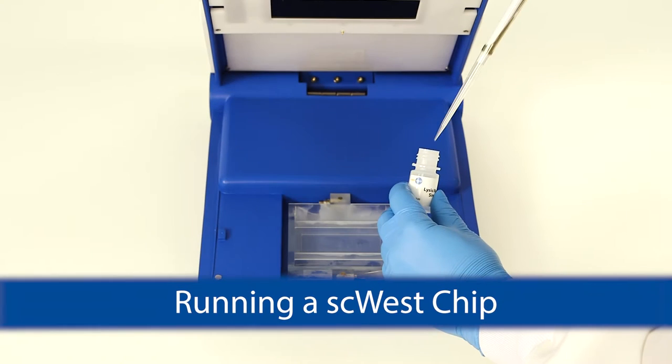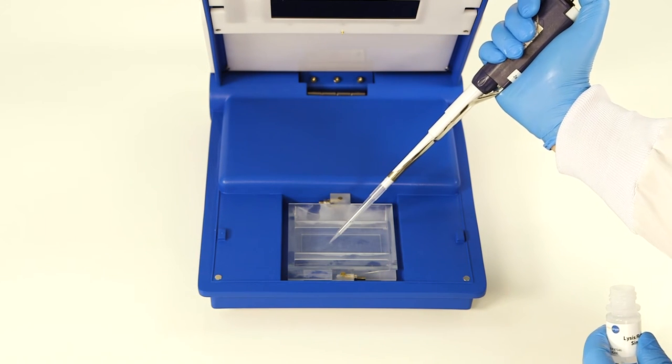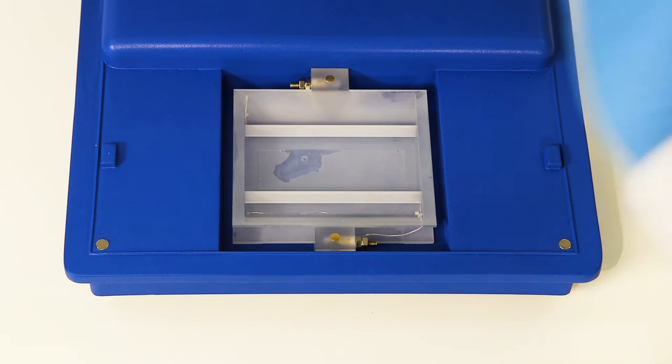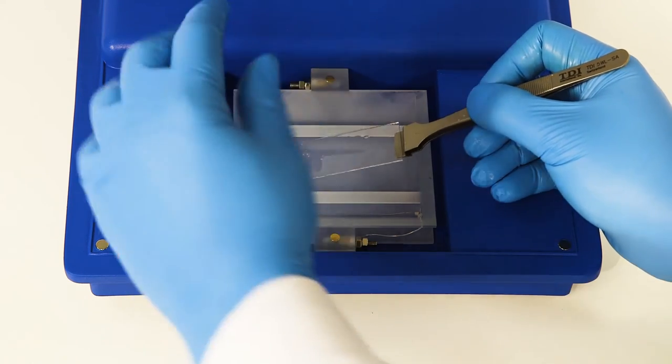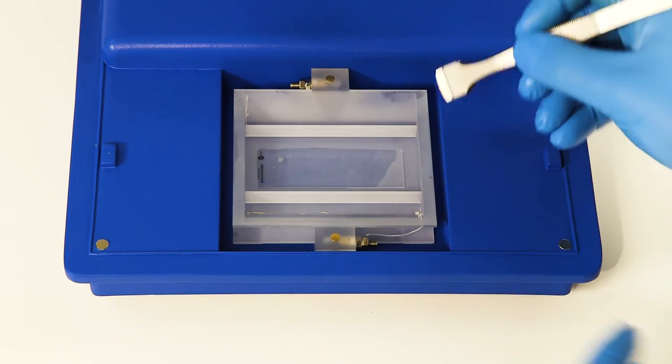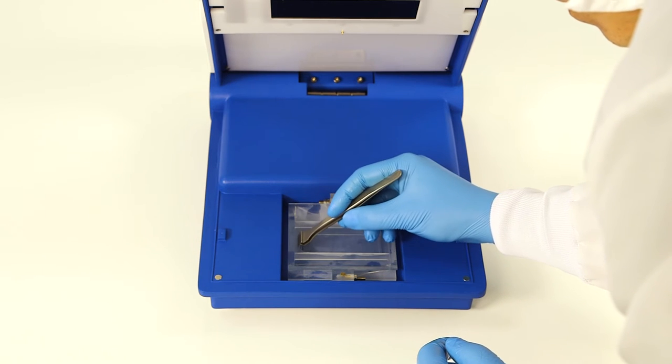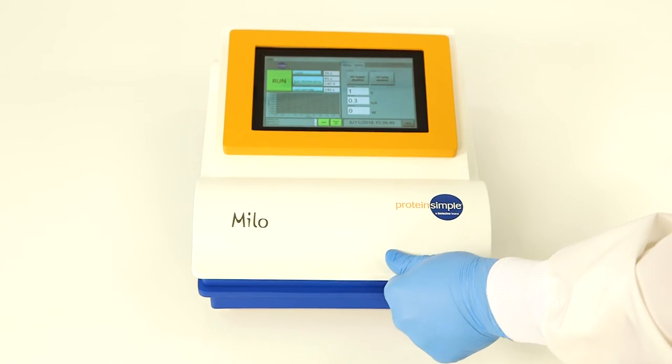To run an SC-West chip, add 300 microliters of lysis buffer to one end of the chip reservoir in the electrophoresis cell. Then carefully lower the chip, gel side up, into the reservoir so that the lysis buffer wicks across the bottom with minimal air bubbles. It is important to make sure that lysis buffer does not get onto the gel surface to avoid premature lysis of your cells.